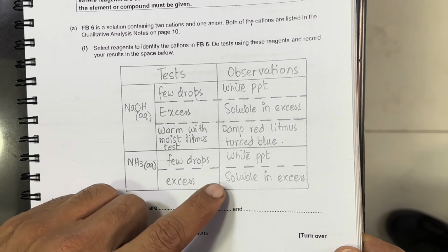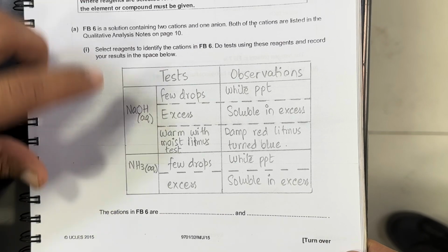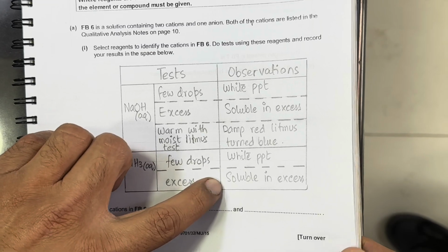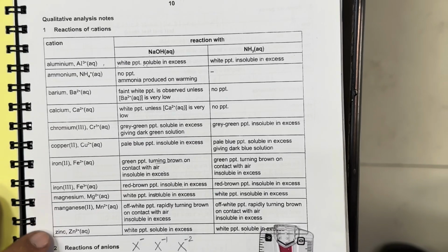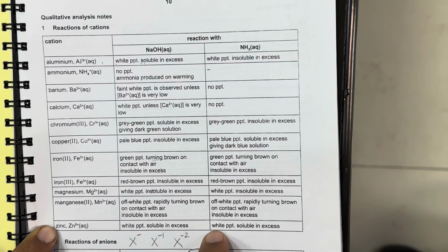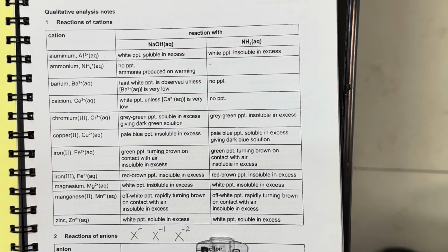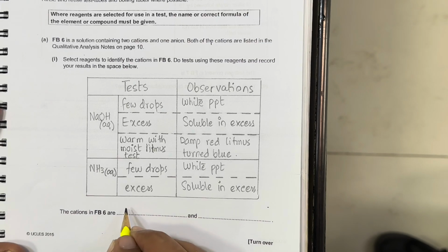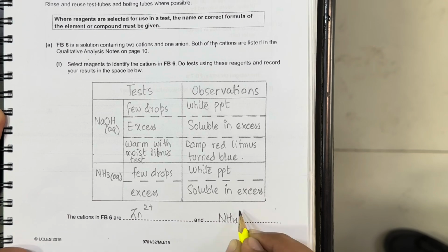Now we have one of the cations detected as ammonium. Now let's look for the other cation. Sodium hydroxide, white ppt, soluble in excess. Ammonia, white ppt, soluble in excess. So let's see, here we have zinc given, which is white precipitate soluble in excess and white precipitate soluble in excess. It means the other cation is zinc. So we have recorded that the two cations are ammonium and zinc. So we will write here Zn2+ and ammonium ions are detected.